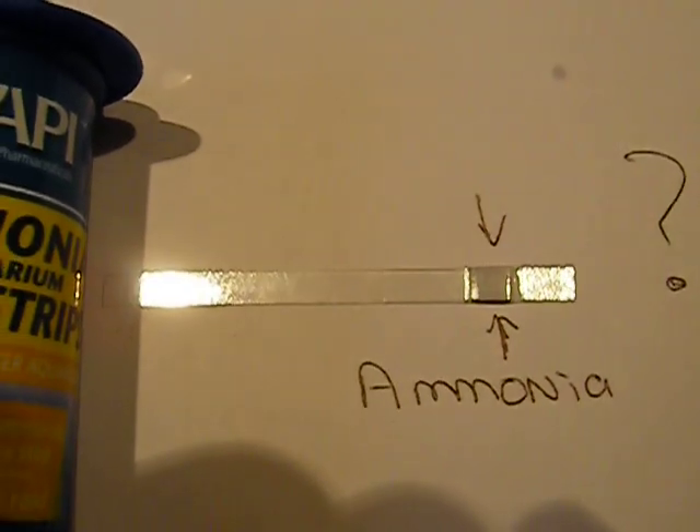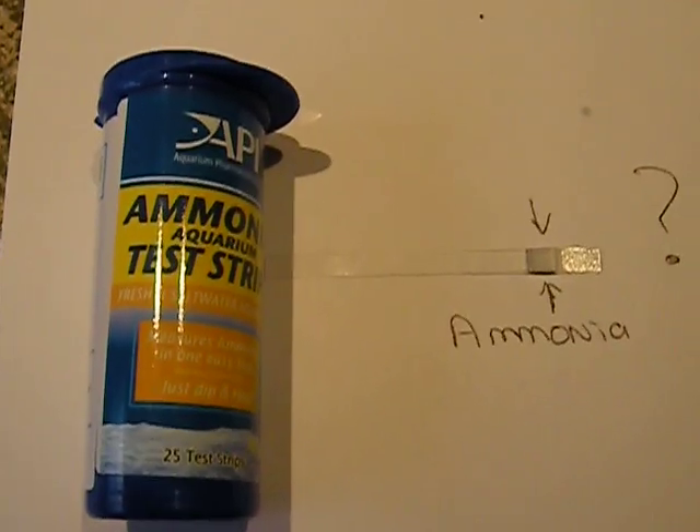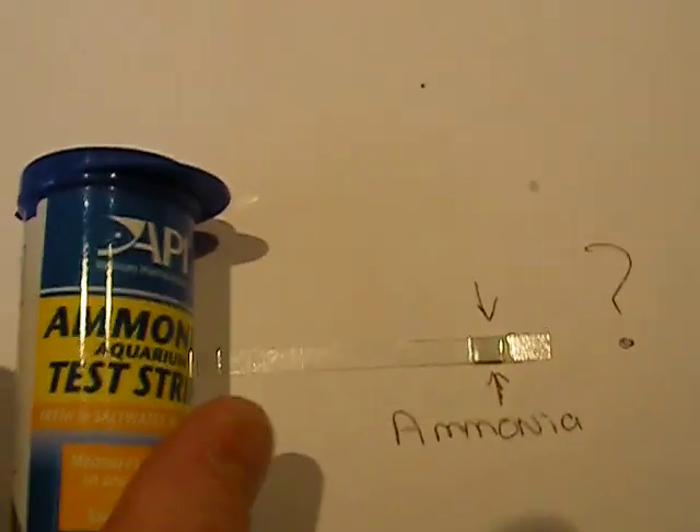Basically you dip your little stick into your water, swirl it around for five seconds, leave it out on the bench like this for 60 seconds, and then you compare what that little pad there is as far as color goes to the back of the chart here.